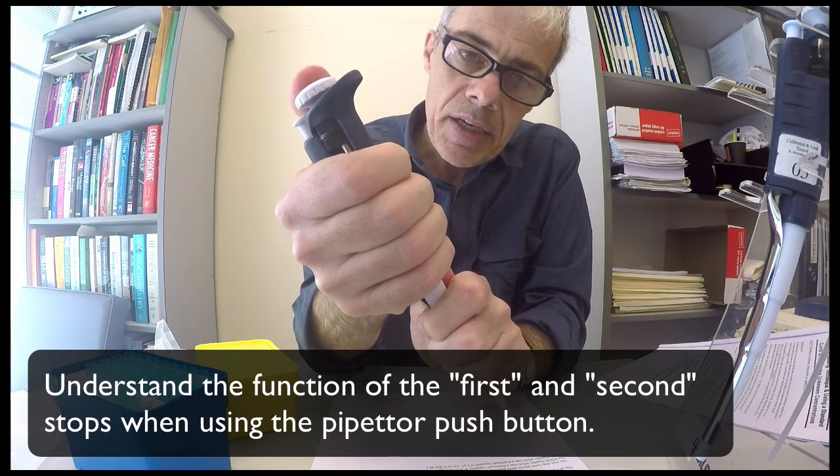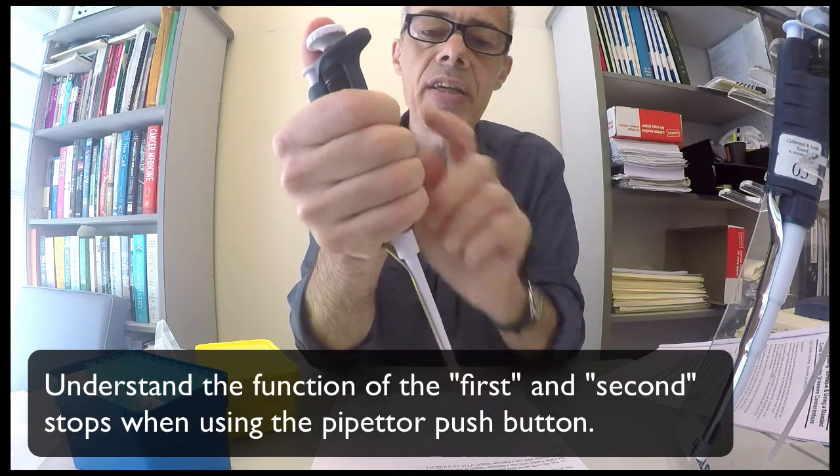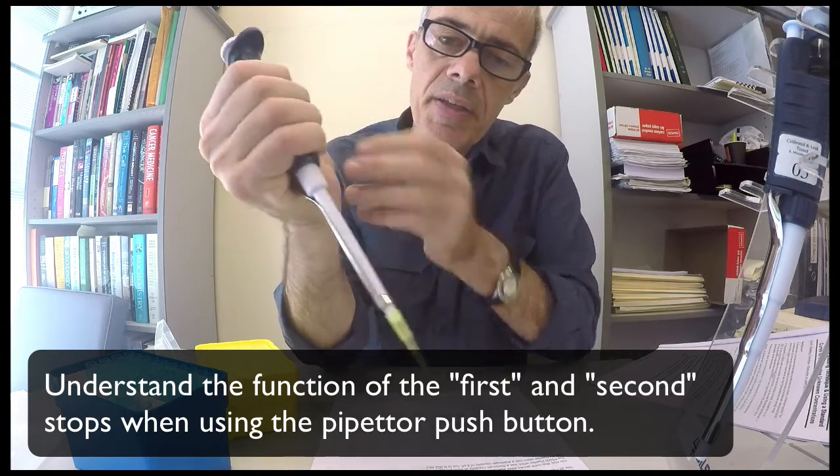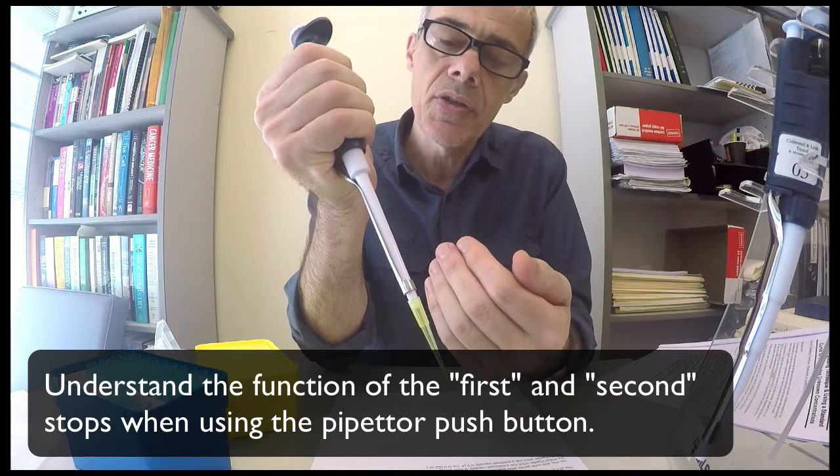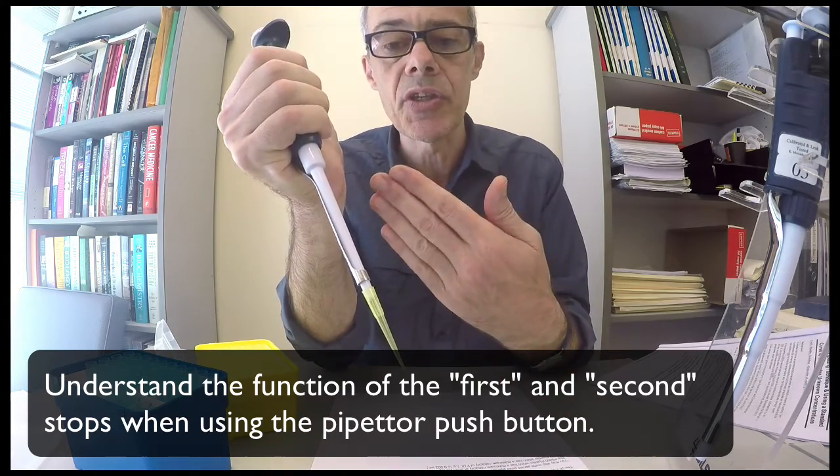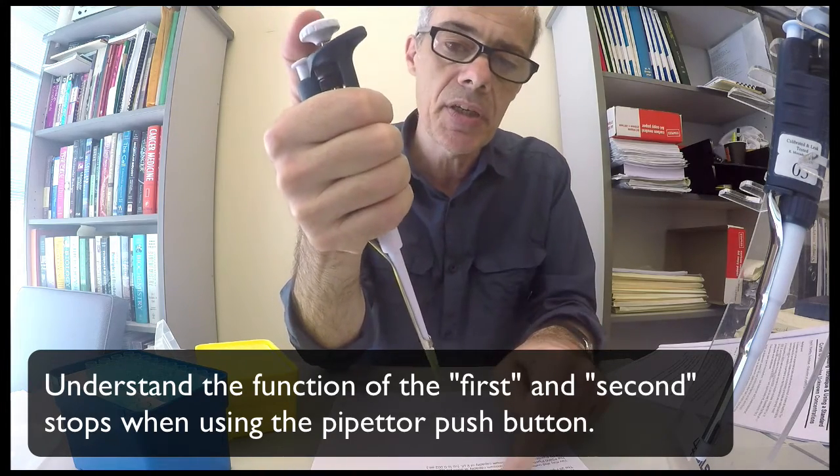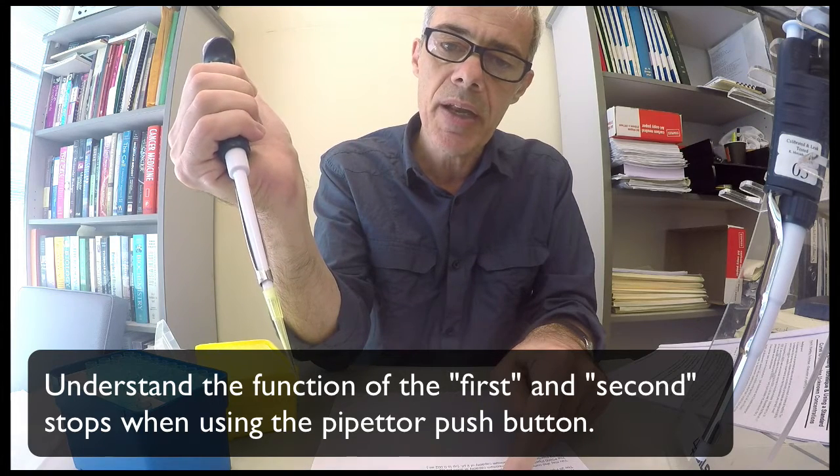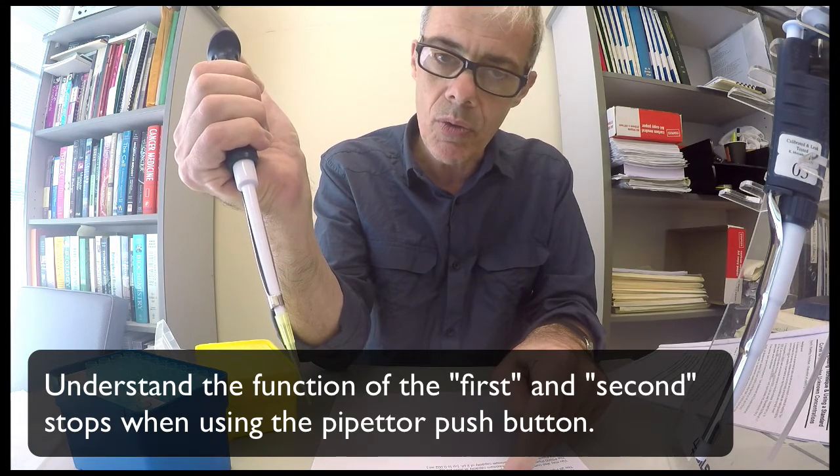The second position is not calibrated, it's just an extra bit of push that dispenses a little bit more air out to expel the solution from the tip. So you don't use that when you're drawing the solution up. You only use the calibrated position to draw the solution up and then when you dispense you dispense all the way down.